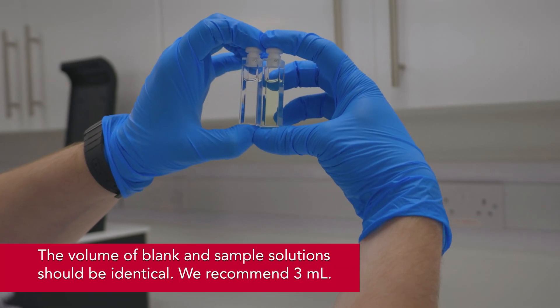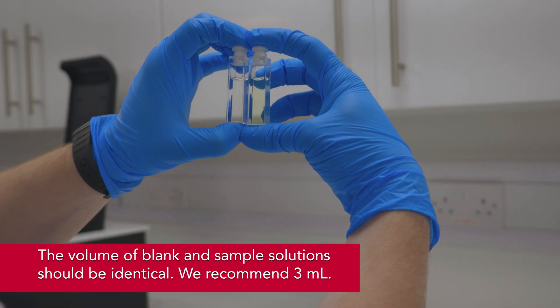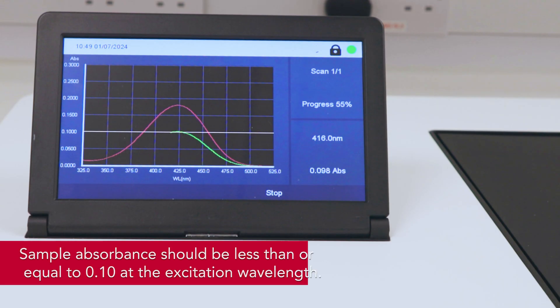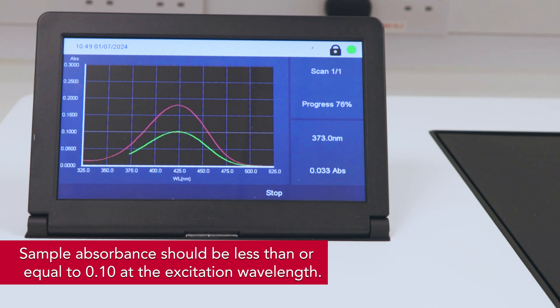The sample and blank solutions should have identical volumes, and we recommend 3 milliliters. The sample should have an absorbance less than or equal to 0.1 at the target excitation wavelength.